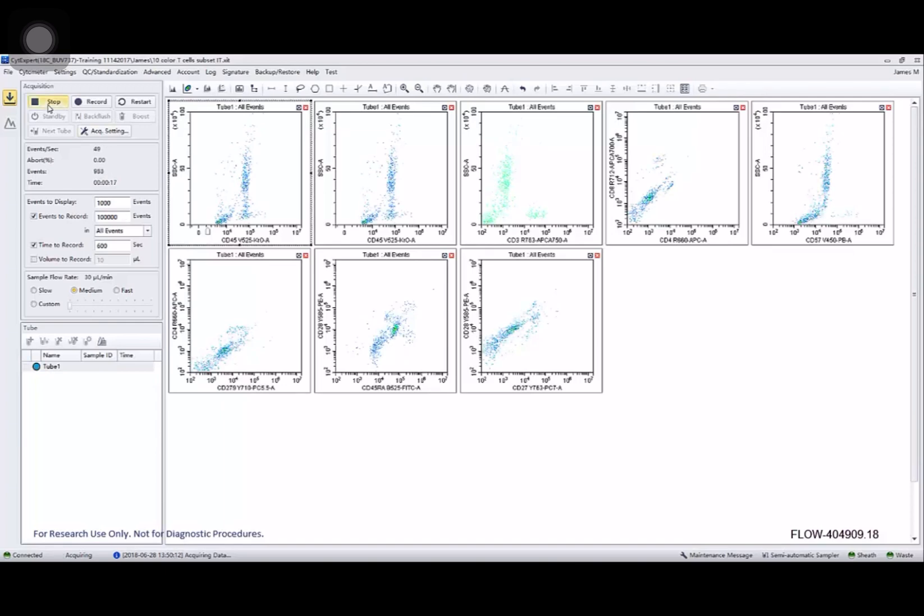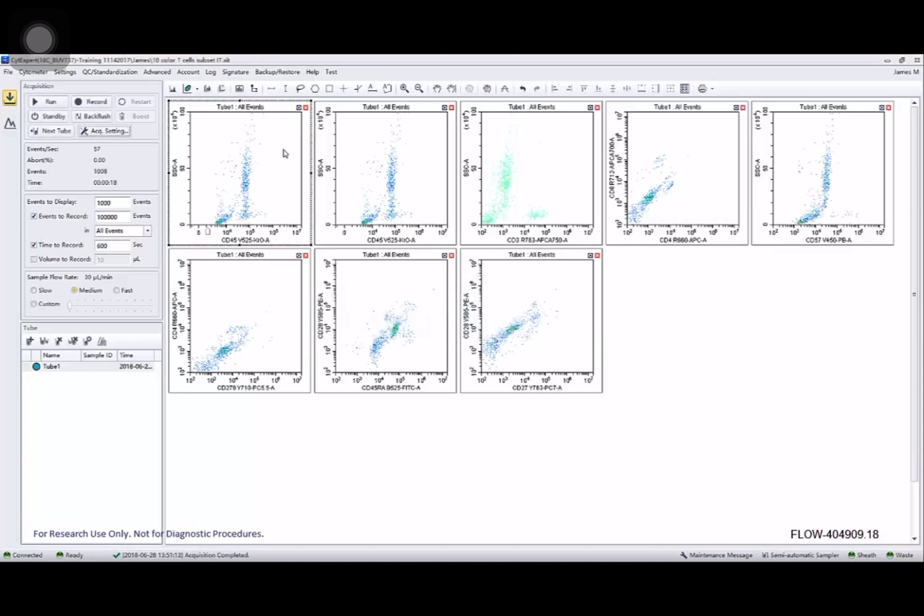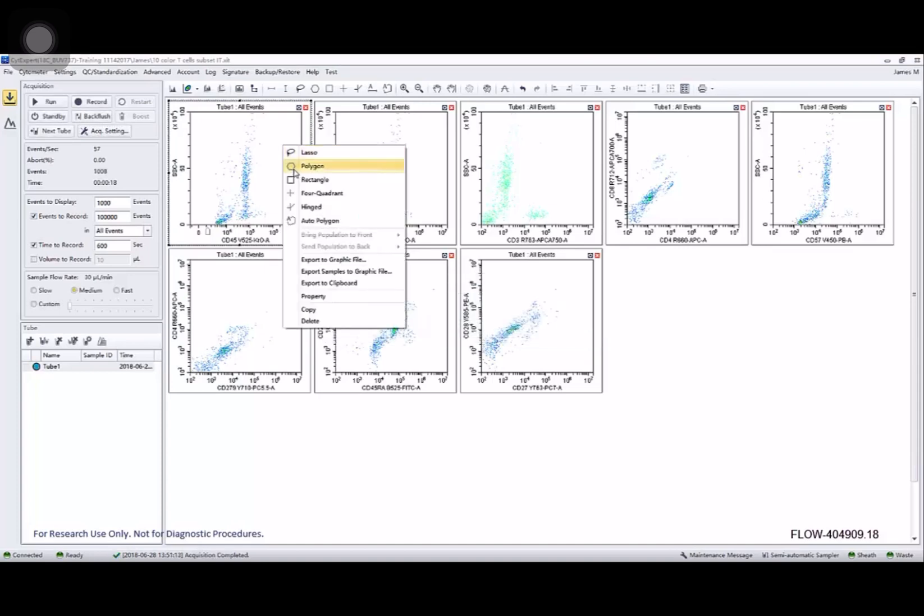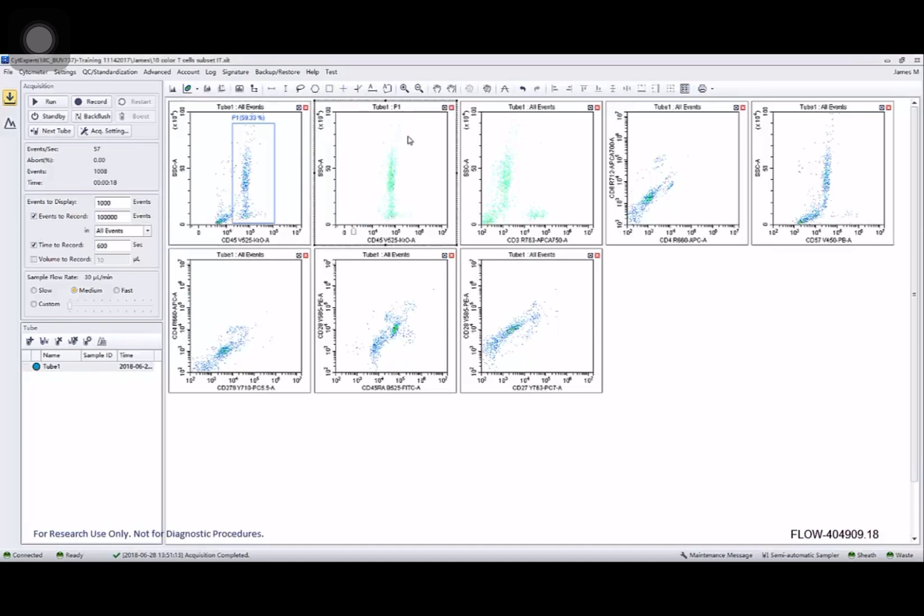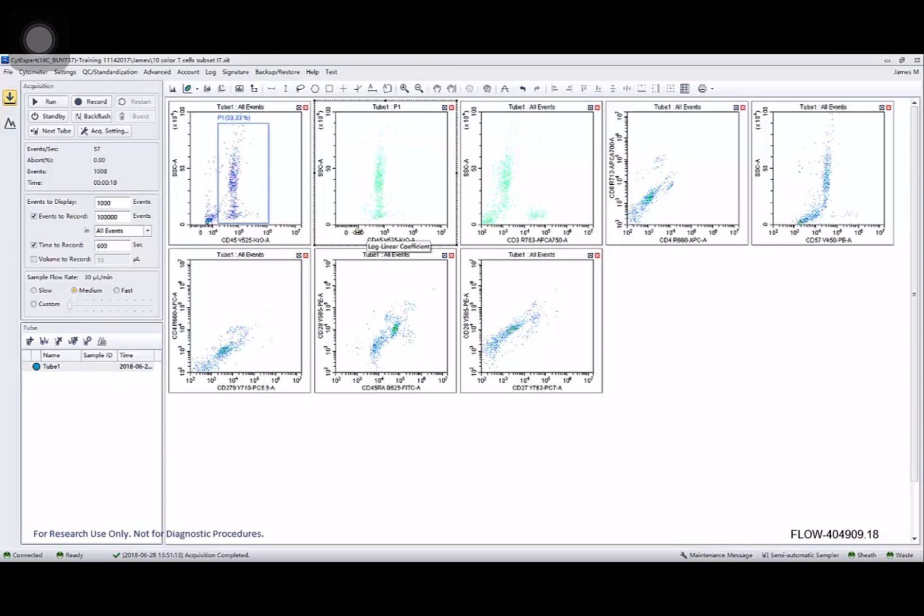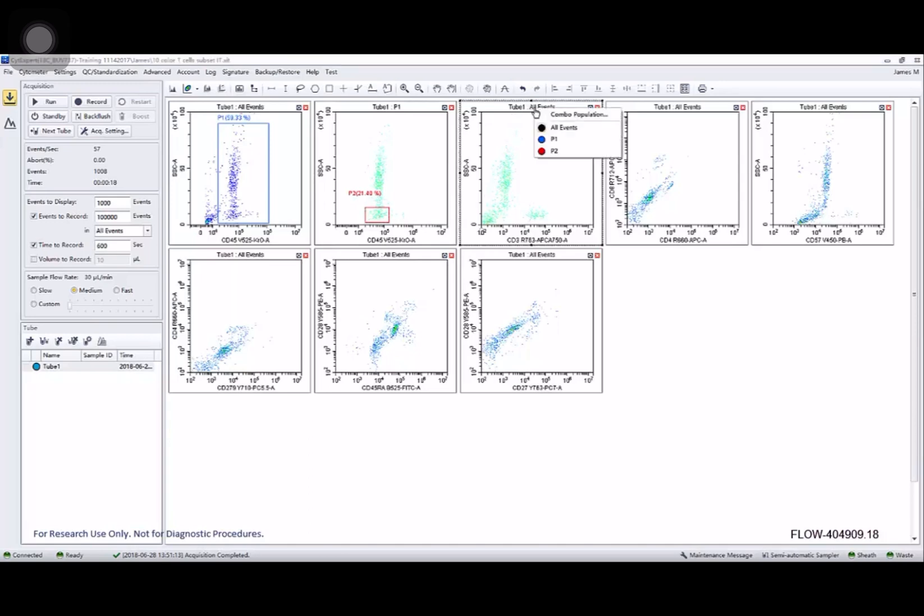All right. I'm going to stop running that and have a look. One of the first things we'll want to do is go ahead and create some regions and use those to gate other plots. So let's draw something around my leukocytes. Apply that to the following plot. And then let's find my lymphocyte population. Gate around that. You can see by right clicking I can change the color of that region or its name.